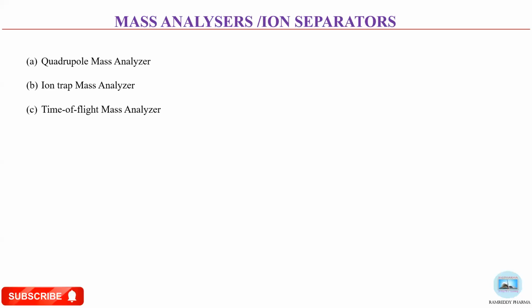Hi everyone, welcome to the topic mass spectrometry. In the last video, we completed the ionization techniques and ionization methods used in mass spectrometry. So today we are going to discuss the mass analyzers.